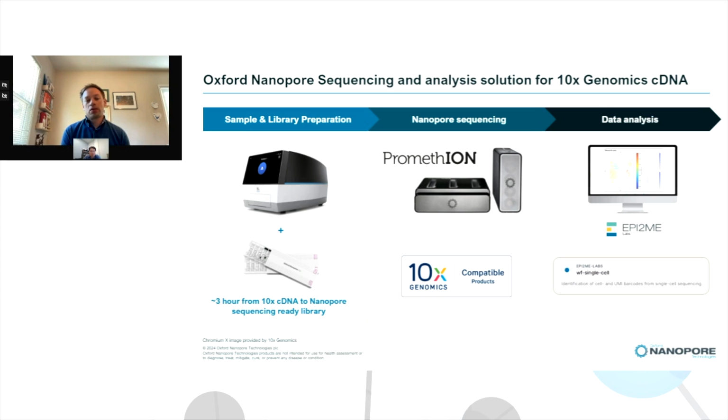Now, the nanopore sequencing solution, many of you are familiar with, but it's a very different technology to others out in the field as well.